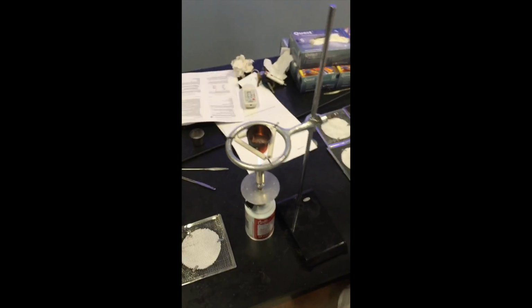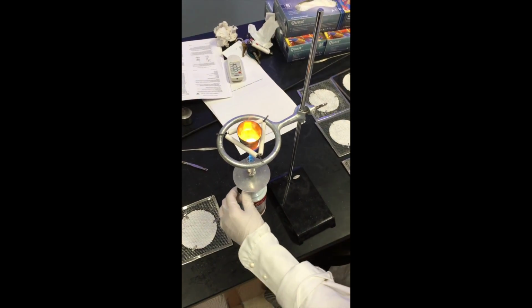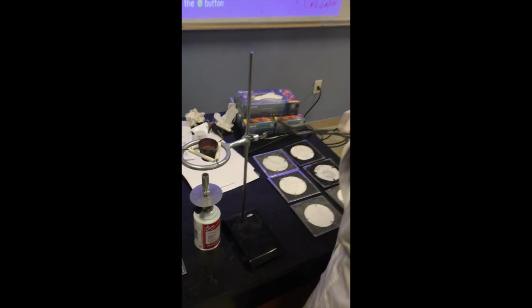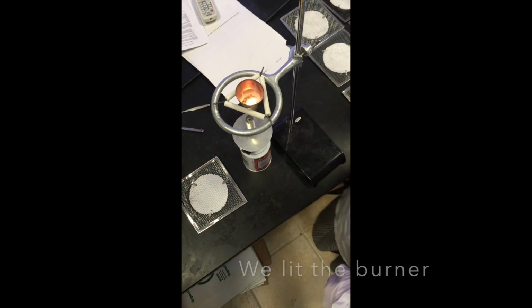For our procedures, we first weighed the magnesium piece and we prepared our setup by attaching the ring stand to the ring support. We then placed the clay triangle to the ring support and we placed the magnesium piece we initially massed into the crucible, which was laid on top of the clay triangle. We then stood back and waited for a chemical reaction to occur.